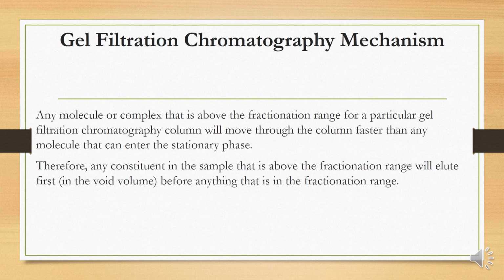Therefore, any component or ensemble that is above the fractionation range will elute first, in the void volume, before anything that is in the fractionation range.